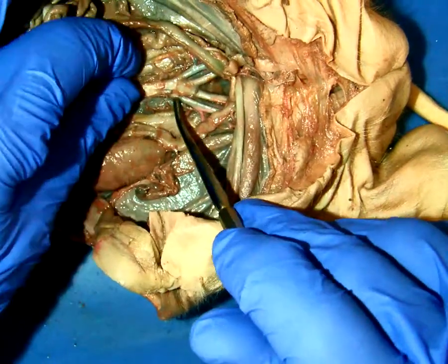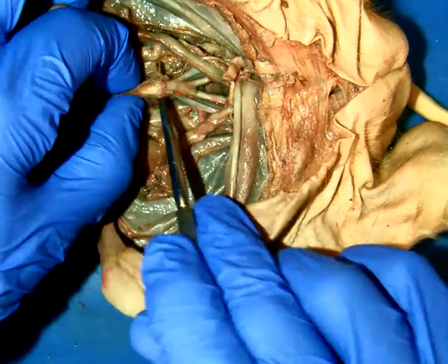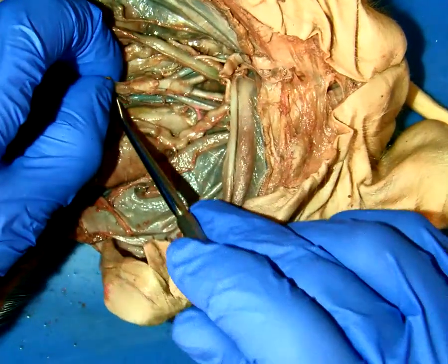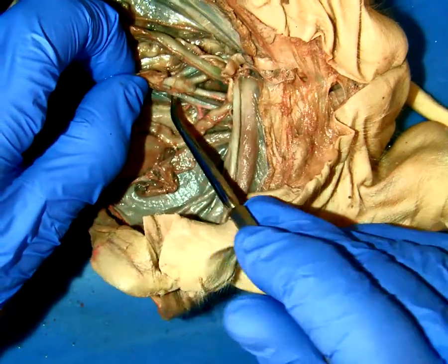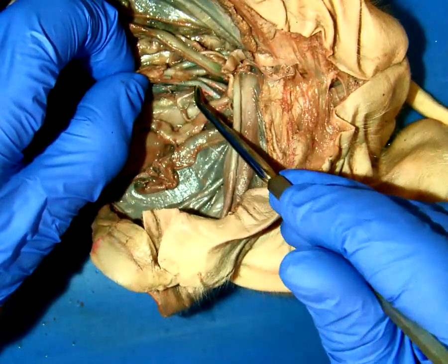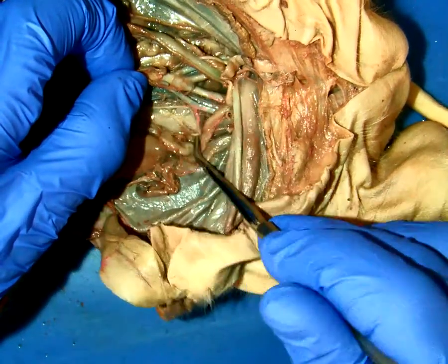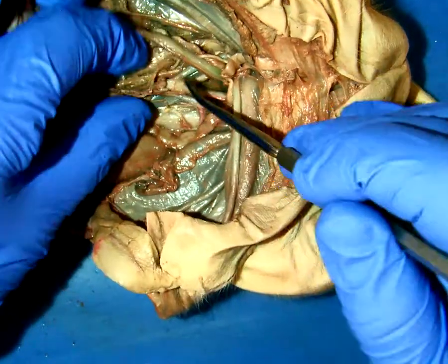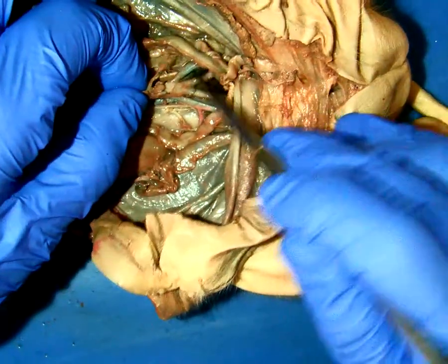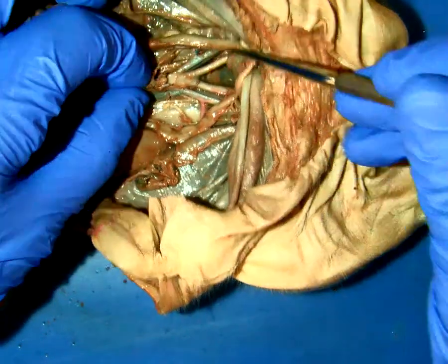And then in the venous, right, when we try to pull up the abdominal aorta and kind of separate them from each other with all this connective tissue, in the venous, this is the one time where the veins kind of move behind the arteries, which is not typical, but they do this in cats and probably in humans as well, right? So underneath these iliac arteries, you can see the vein just kind of peeking through here.